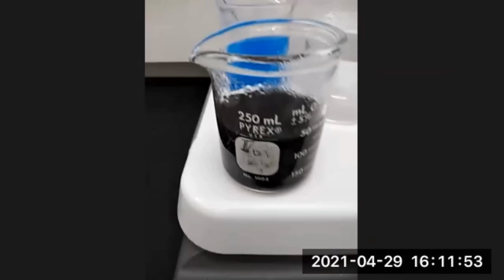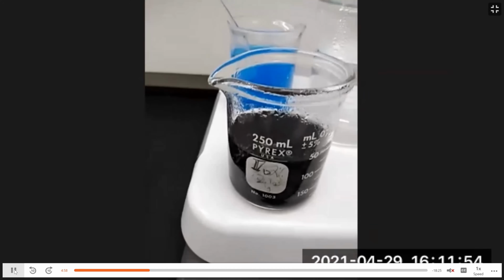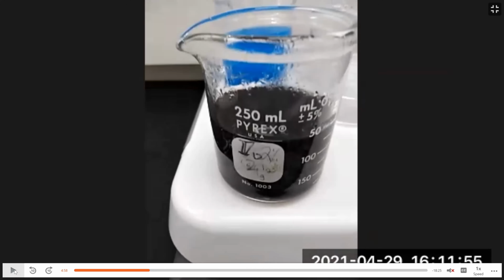You can see behind it in another beaker, that's the initial color, the blue precipitate. As you heat it, it turns to a black precipitate. You want to let it settle to the bottom, because now we're going to have to remove that top layer of liquid or solution from the beaker. So this is the product of the decomposition reaction.